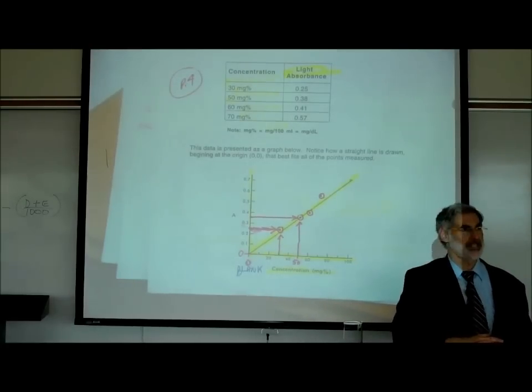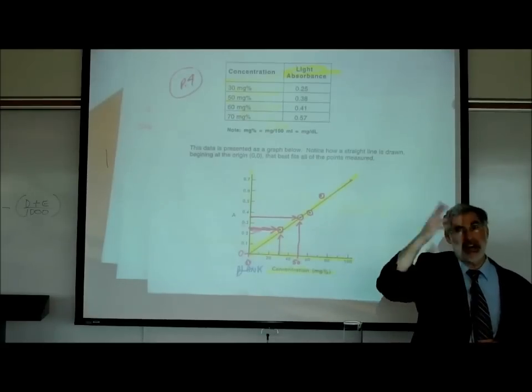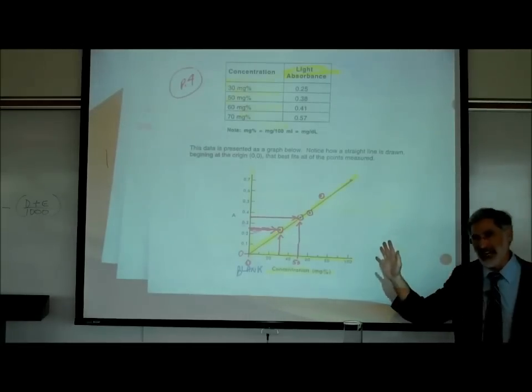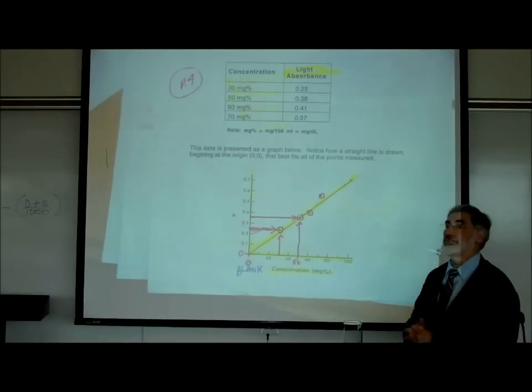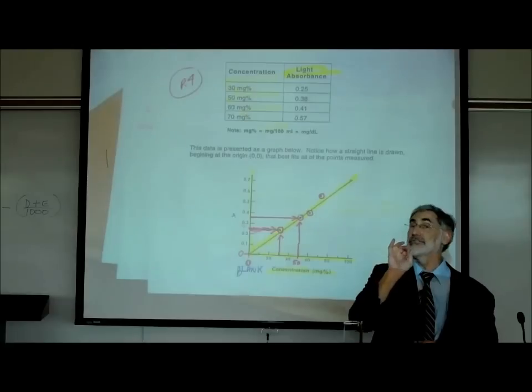Anybody ever do gas chromatography? All right, so gas chromatographs use another method of absorption spectra to identify what the molecule is. But again, this is not a course in chemistry, so I don't want to go too far on this. So as long as it's a different wavelength, you're able to measure the concentration of different chemicals. Exactly.